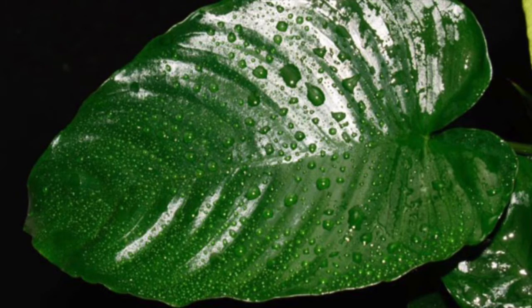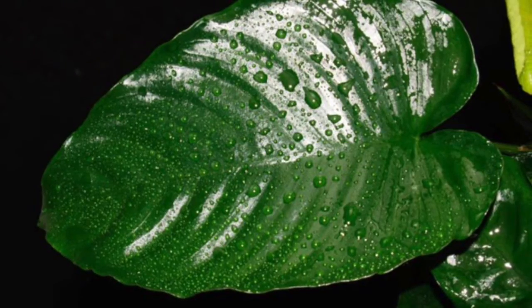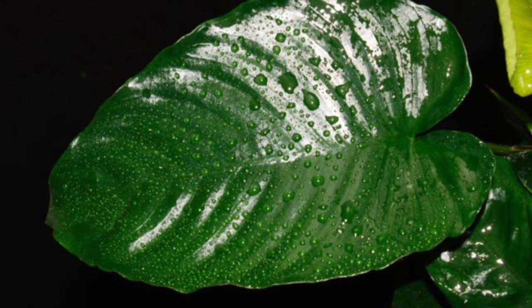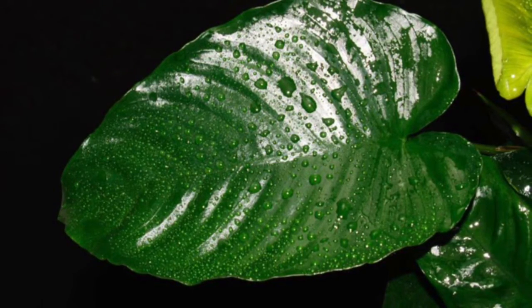The waxy texture of the myrtle leaf made it difficult for surface tension to break, so we added more soap to the solution, which made the ratio of CO2 to soap lower, again causing the photosynthesis rate to be slower or inhibited.